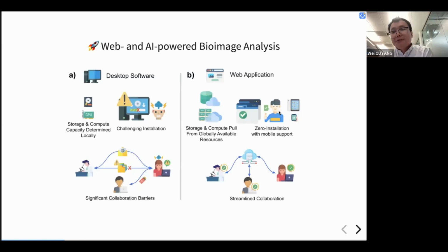You can also use it with mobile devices, which is great if you can, for example, annotate images on a tablet, right? With a touchscreen, for example, or with a pen. The collaboration becomes much easier if you have a central server and you can just send links around, and the updates by default are synchronized easily, right? So much easier than the desktop. So there are a lot of advantages to moving to the web.